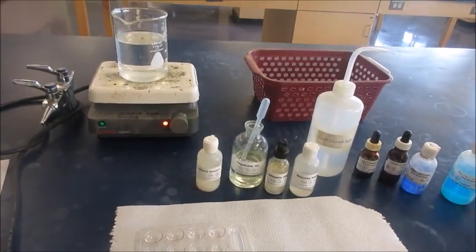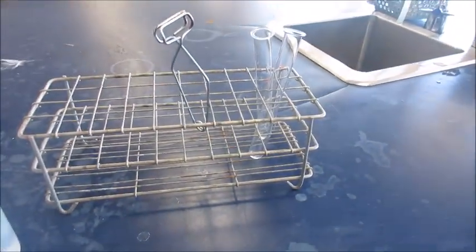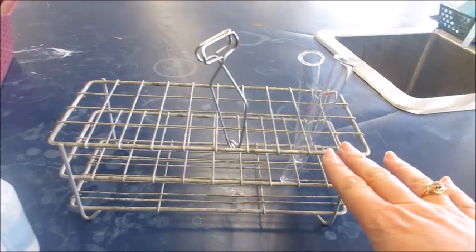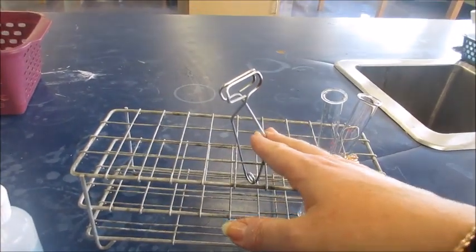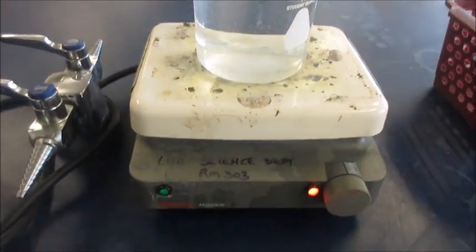In today's nutrients lab, you'll need the following: a spot plate, two test tubes, a test tube rack, and test tube tongs. You will need a beaker and a hot plate.